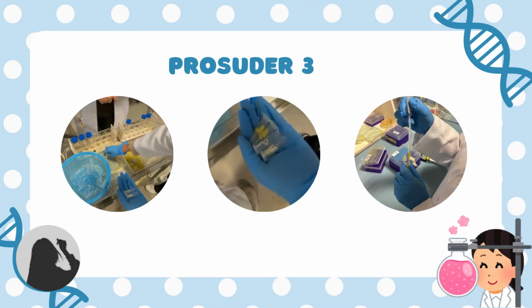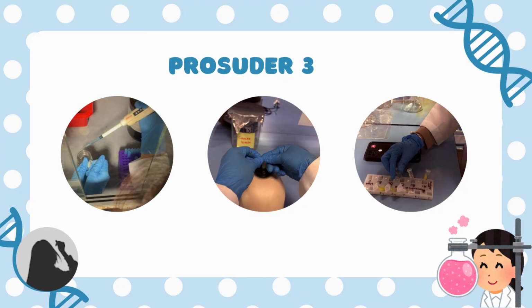The next step involves testing the solubility of the lipid-containing product in a polar solvent, distilled water. This part of the experiment we perform using set 1, tubes A1, B1, and C1. Using a clean dropper, carefully add 1.0 milliliter of distilled water to each tube in set 1. Next, to test the nonpolar solvent toluene, we added 0.5 milliliter of toluene to each tube in set 2, which is A2, B2, and C2. Then we cap the tube and shake gently to mix.